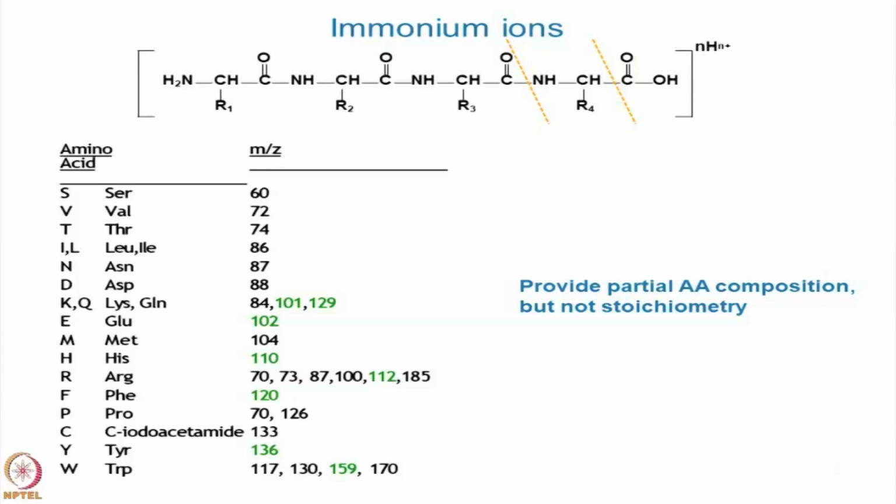From a terminology standpoint, that's a distinction between the manufacturers. If you have a QTOF instrument that comes, say, from SciEx or from Agilent or Bruker, they might call that fragmentation technique CID. That fragmentation is exactly the same thing as what Thermo calls HCD.